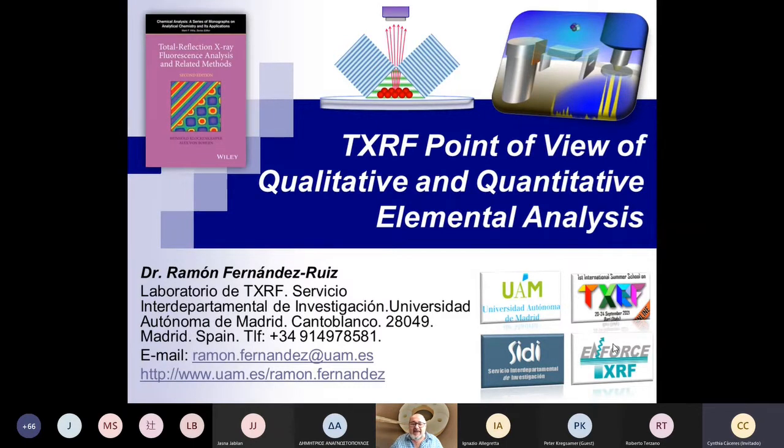The idea of this conference talk is to give a qualitative and quantitative elemental analysis point of view from the TXRF technique, because it's special, as you know perfectly.